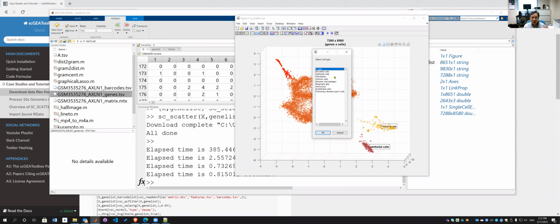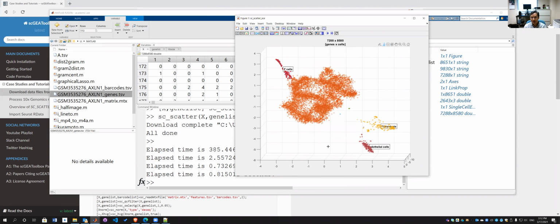Now we are running into some of the most difficult stage of the study. We don't know the samples very well, and the database suggests, using the marker genes, a very diverse set of potential cell types. So we don't know which one to select. So let me just stick with the top selection and see this T cell.